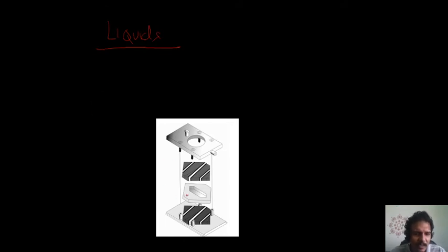They will take a plate. On it they will use one drop of the sample and they will mix it with nujol. Nujol is a mineral oil.